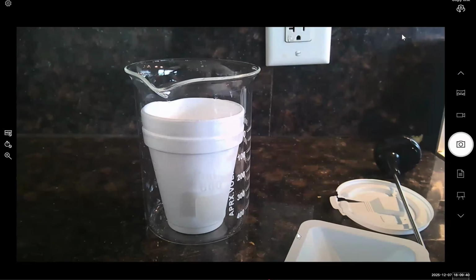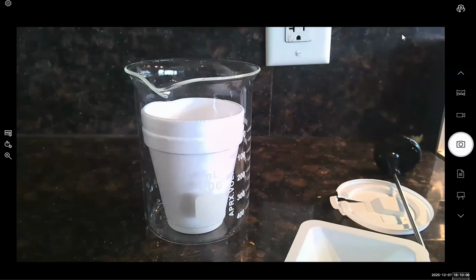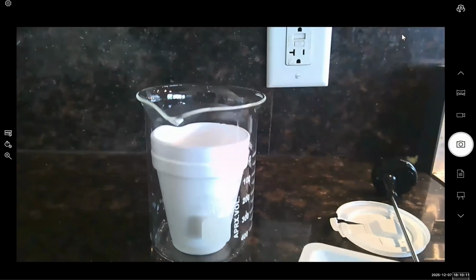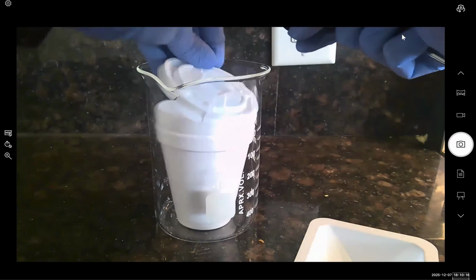So we have our coffee cup calorimeter ready to go. We then transferred the heated metal piece into the coffee cup calorimeter once again, and we're going to start recording the temperature. So as you watch the video, we're transferring the metal piece into the coffee cup calorimeter. The metal piece that's been heated goes into the calorimeter. And now we're going to record the change in temperature over time. So we're going to cap our calorimeter and start recording the temperature.